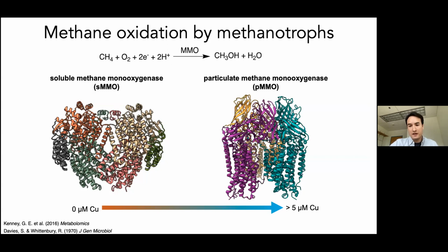One other thing is that we isolate pMMO from the native organism, so we are a little bit limited in our ability to do things like mutagenesis of essential residues in the enzyme.